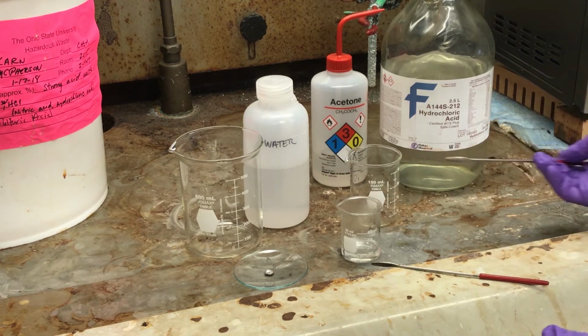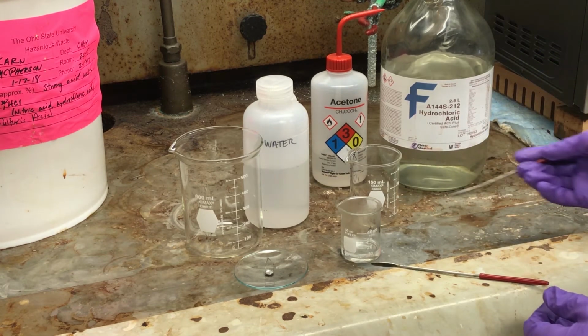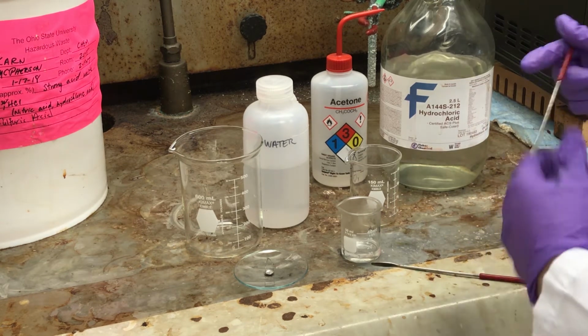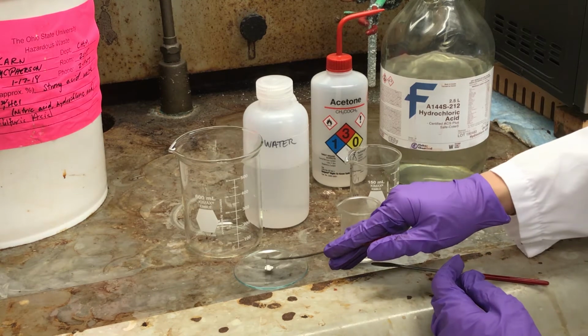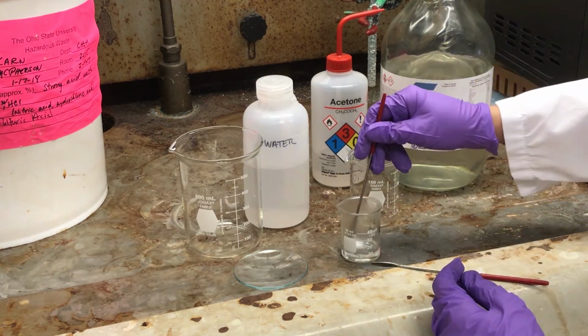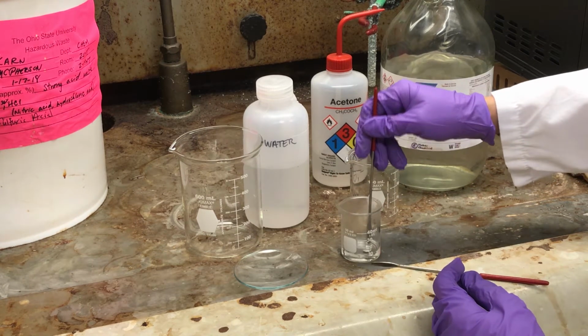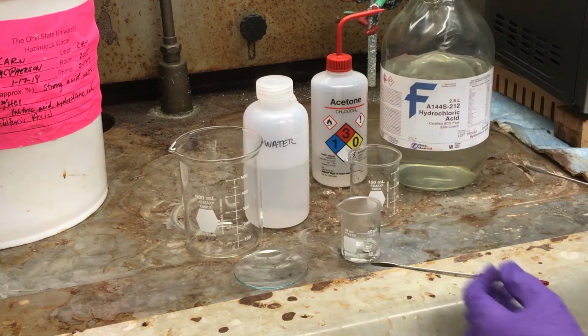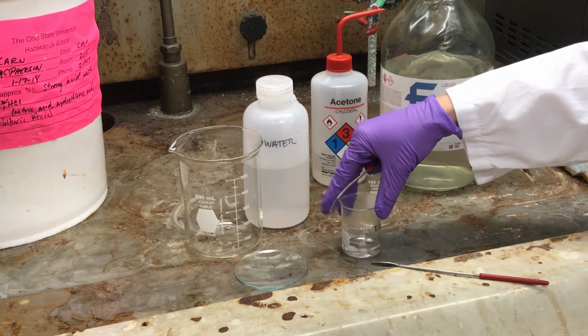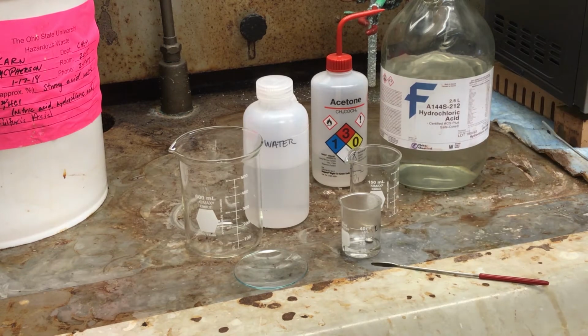So I've put about 10 milliliters of concentrated hydrochloric acid in the beaker. Please keep the hydrochloric acid in the hood for your safety. It does off gas quite a bit. And then place your pan in the hydrochloric acid. You may see some bubbling. You may not. It just depends on how dirty the pan is. So I'm just going to let that soak for a few minutes.